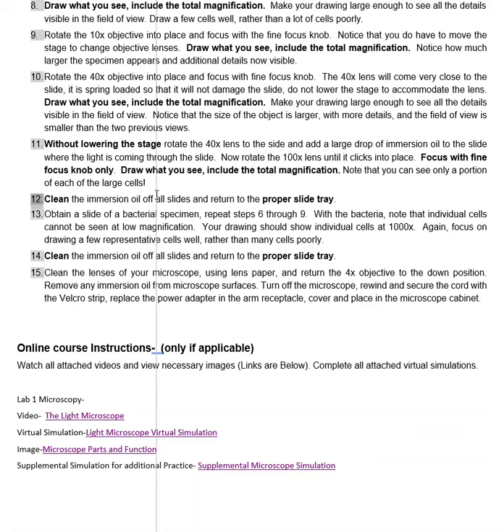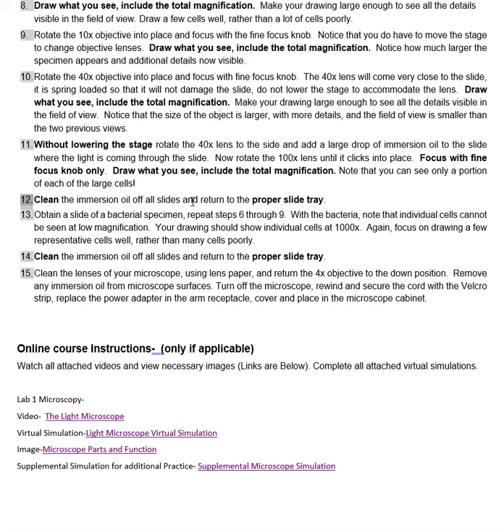Once you're finished, the thing you've got to do is to clean that oil off the slide. So in this case, remember slides, chem wipe. I don't know why I was wanting to say kiwi wipe. Maybe I'm hungry, who knows. But in any case, you use a chem wipe to wipe off the slide. You use a lens paper to wipe off the 100x, because it will have oil on it because the oil was touching the slide and the lens. You've got to blot it and make sure you get all of it up, because if it's allowed to dry on there, it will cloud that lens. And again, these things are way expensive, guys.